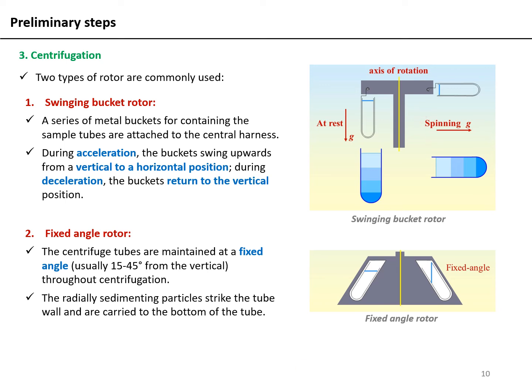So this is what you achieve in the case of a swinging bucket rotor, and this is exactly the same thing that we discussed a couple of slides back.